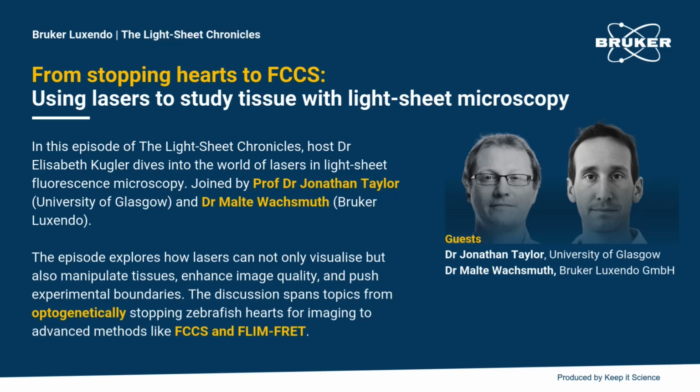What you can do, you can basically pivot your beam rapidly around the center, around the beam waist of the beam, which is typically in the center of the image, of the field of view. And like this, you can also generate a broad range of angles to illuminate your sample, which allows to remove these shadowing effects. So you can do it statically and also dynamically.